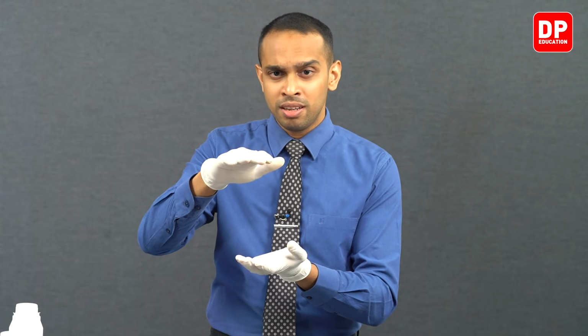And we saw the aqueous layer and the sulfuric acid we added were present as 2 separate layers due to the higher density of concentrated sulfuric acid. And at the interface, we saw a brown color layer was formed. This is where the reaction takes place, at the interface between the 2 layers. So therefore, we can observe the formation of a brown color complex.